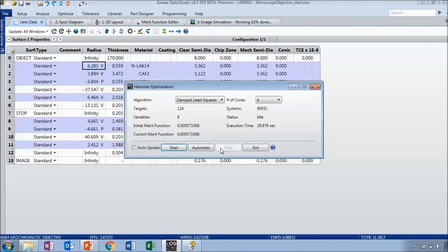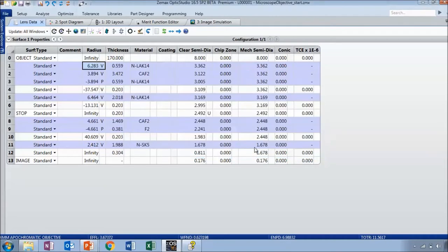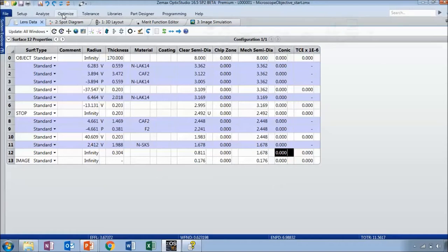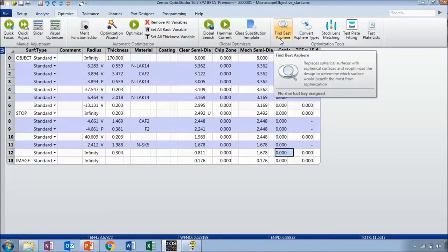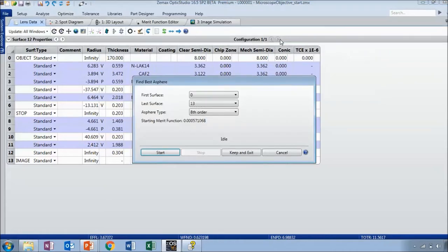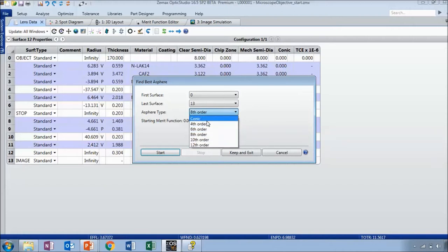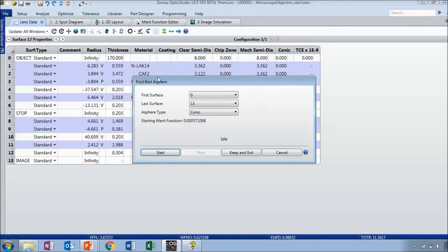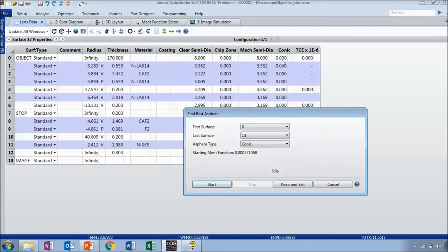It doesn't look like it's going to find a much better solution now, so I'll stop it. We can try running this again after I change one more thing in my system. Right now all of these are standard surfaces and the conic constant is zero. But let's say we wanted to turn one of these into an aspheric surface and optimize the conic constant. We have a tool for that called 'Find Best Asphere' in the optimization tab.